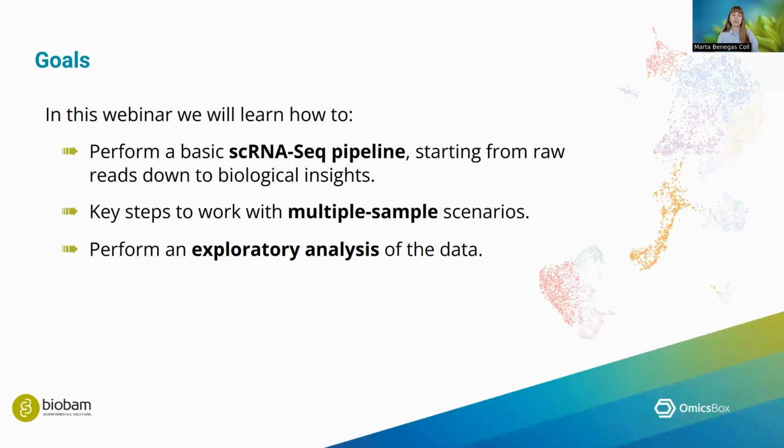So the goals of this webinar will be to learn how to perform a basic single-cell analysis pipeline, starting from raw reads down to biological insights, the key steps to work with multiple sample scenarios, and how to explore our data in order to gain those biological insights.